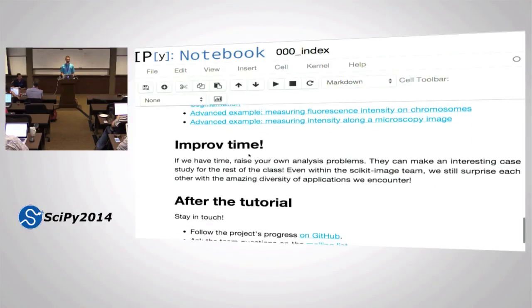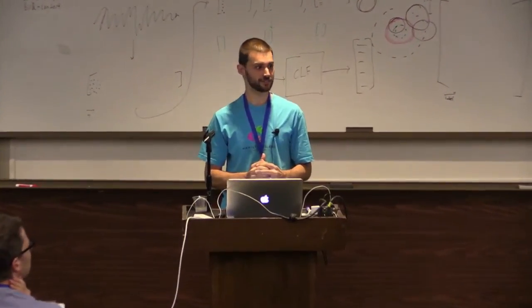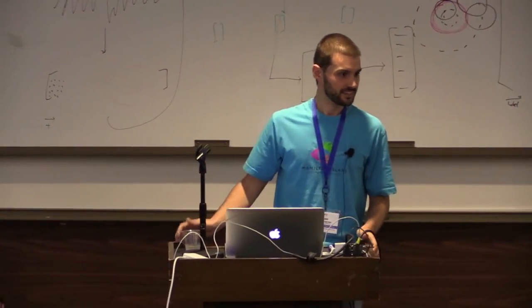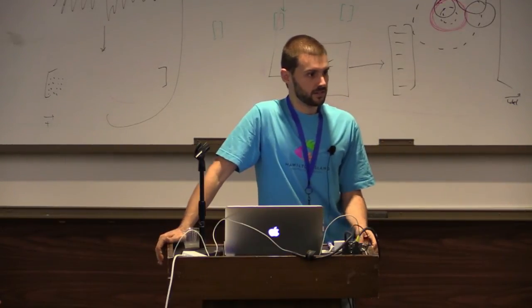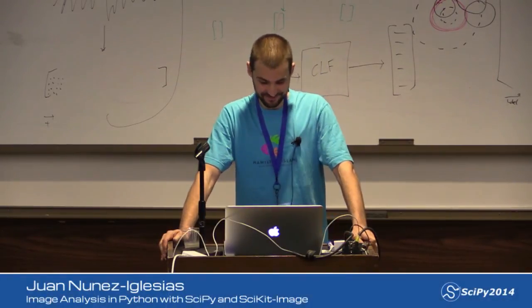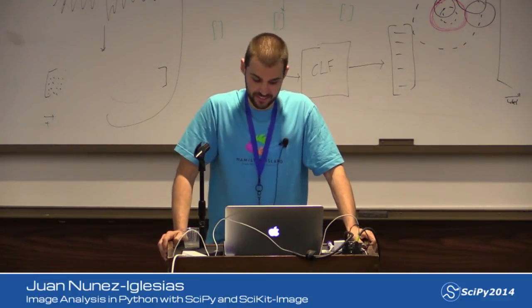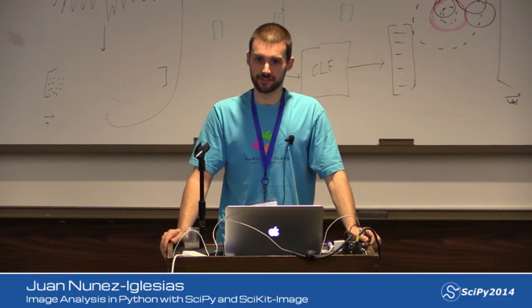Any questions? Yep, so that's the end of the tutorial. If you have your own images that you want to fiddle with, we have a small amount of time. We will hang around and answer questions. Yeah? No, you'll have to build your trajectory. But that's a cool idea. Yeah, so if you have your own images, we'll stick around till time.